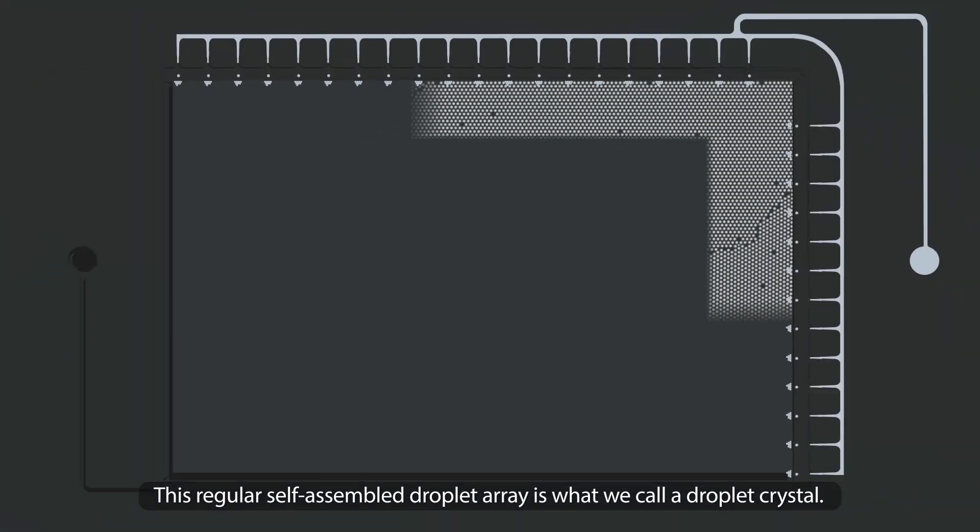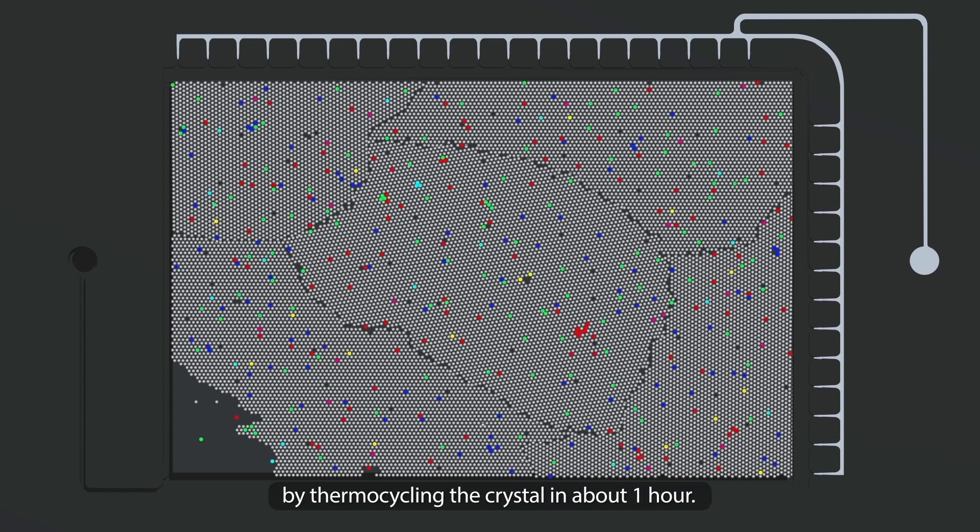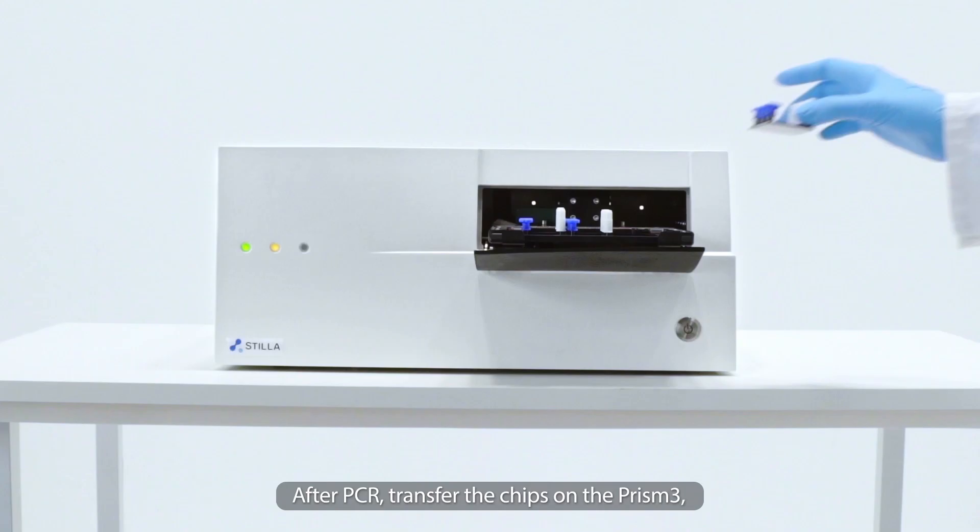This regular self-assembled droplet array is what we call a droplet crystal. The geode performs fast PCR amplification of the targeted nucleic acids by thermocycling the crystal in about one hour.